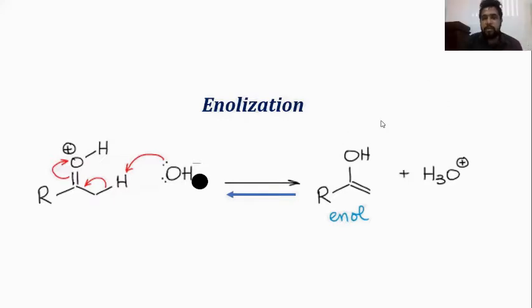Okay, this is the process I told you about, enolization. And here this is a free aldehyde group. You know that in reducing sugars there's either a free aldehyde group or a ketone group. So when there's concentrated sodium hydroxide and heat, this will form enolic substances. Enol means a hydroxyl group with a double bond. These enolic substances are yellow in color and they are quite unstable.